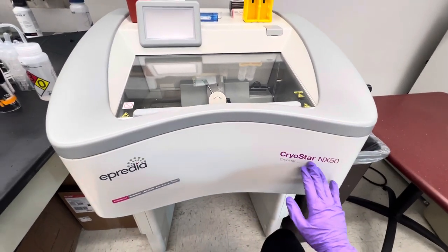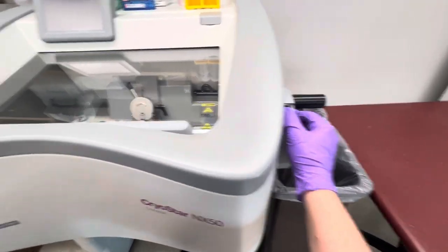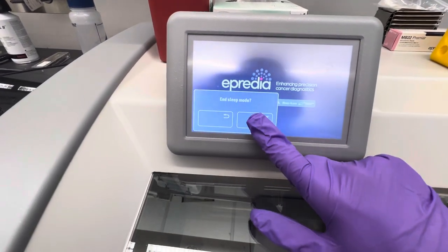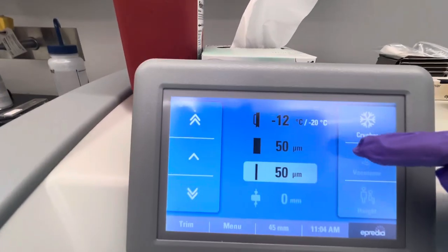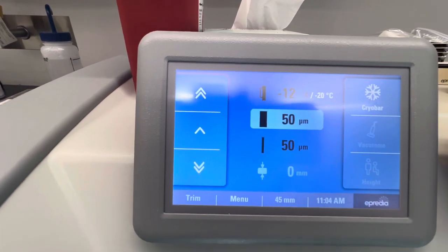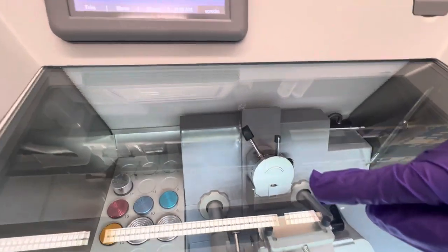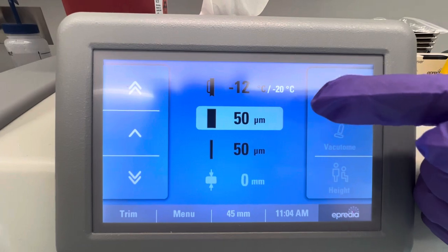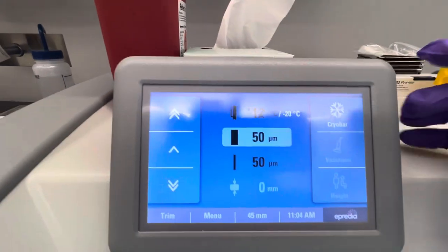So this is, again, this Cryostat NX50, which you would have read on the protocol, but if not, that's fine. To get started, we'll start with the control panel, which should be on. It'll turn back off on its own, so we don't worry about that. This is for taking fine sections. This is for chopping off the face. Whenever I say the face, whenever you have a block here on the specimen head and it's mounted up on there, this is to help chip away in a manner that isn't fine or refined, because you're just chopping off pieces of block until you get to the shadow of the tissue.